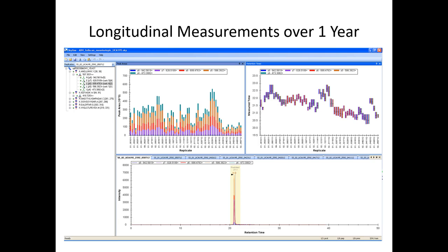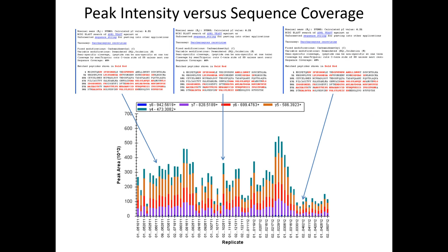Obviously, if you put a new column on, your retention time is going to shift. And that's to be expected, but as long as you can make a note of it, then going forward from that point on, trust me, you don't want to be in the situation where you're like, oh, I've seen this problem before, and we fixed it, but what did I do? This is the kind of way that it will help, and using the notes feature in Skyline that are sample specific will allow you to keep track of stuff like this. So it's an electronic notebook.